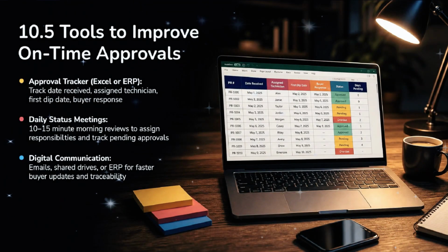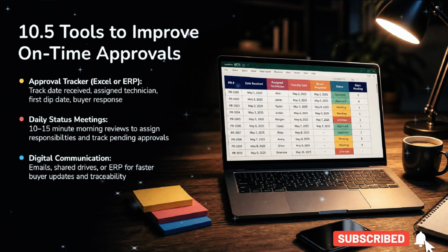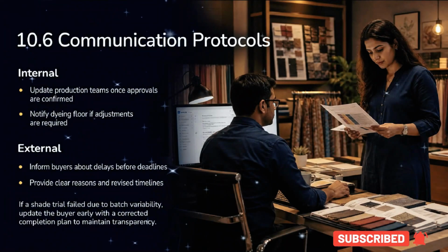Utilize effective tools to improve performance. Maintain an approval tracker in Excel or your ERP. Hold 10 to 15-minute daily status meetings to align the team, and use digital communication for faster updates and better traceability. Establish clear communication protocols.